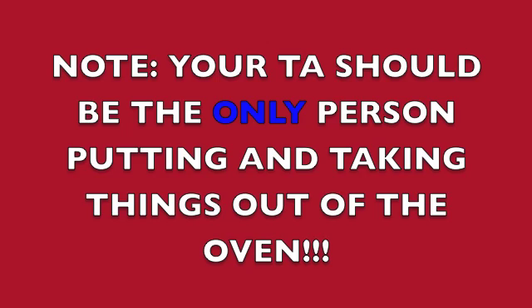Bring the beaker over to your TA. Note that your TA should be the only person putting and taking things out of the oven.